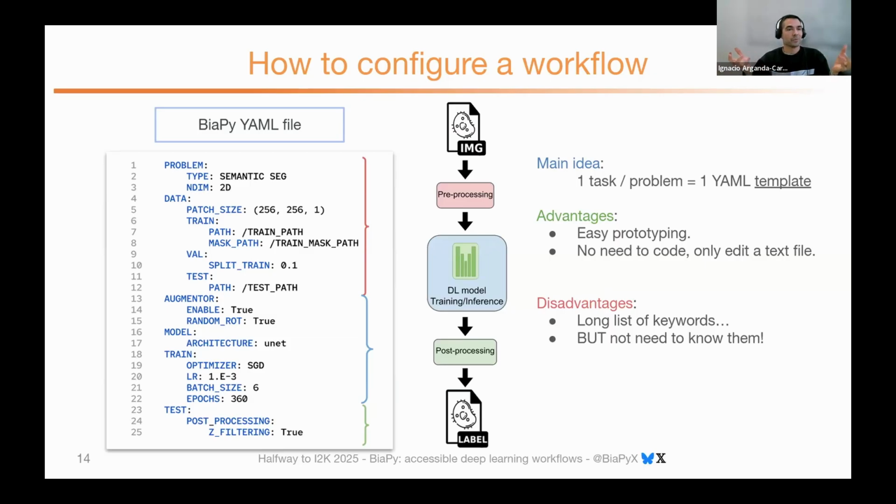But of course, you can say, wait a minute, I don't know all those keywords. I don't want to go and run into the documentation to see what every keyword means. And honestly, I don't know all the keywords either. Because in the end, what we usually do is that we produce those text files through a notebook or with the help of the wizard. So you can do it in a more human way.